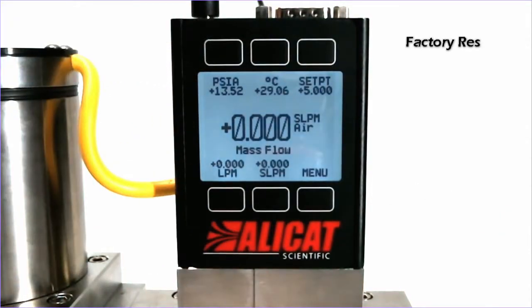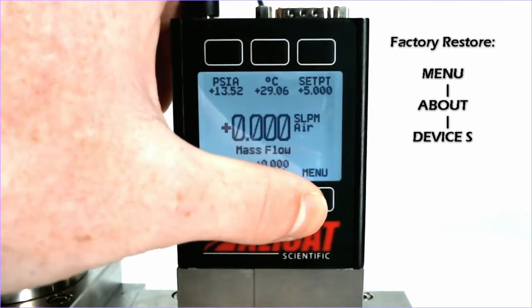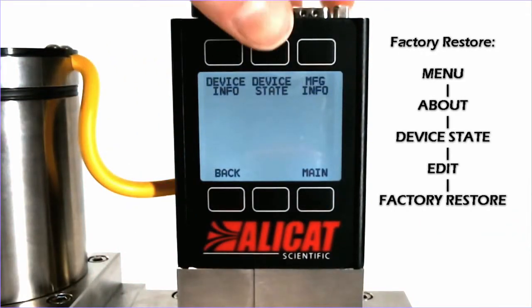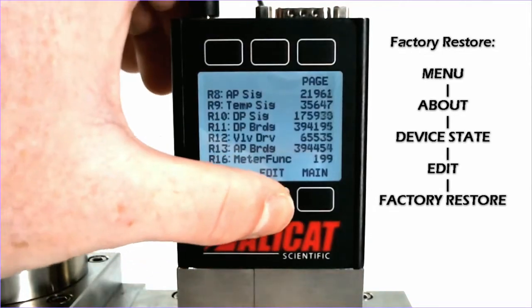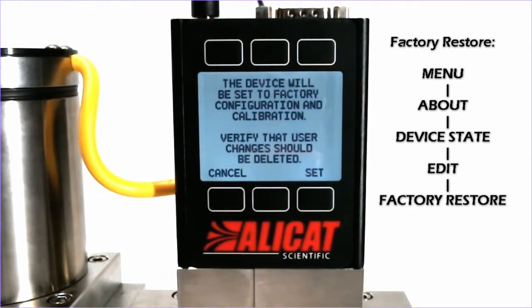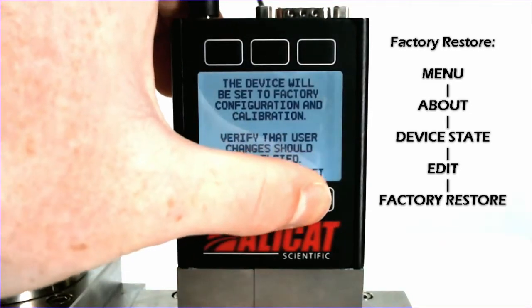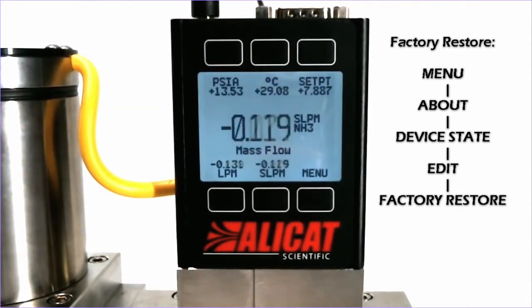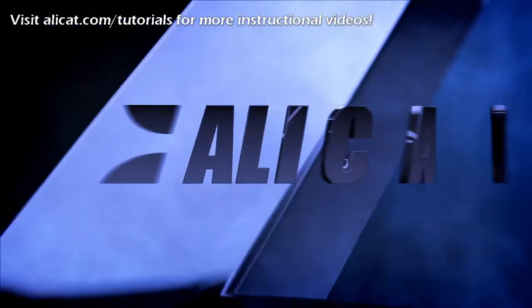In order to factory restore the device, we will go that same route: Menu, About, Device State, Edit, and we see Factory Restore at the bottom here. We will click that, it will give us a warning that the device will go back to its default configuration when it left our facility. You will hit Set, and that is how you factory reset a device.